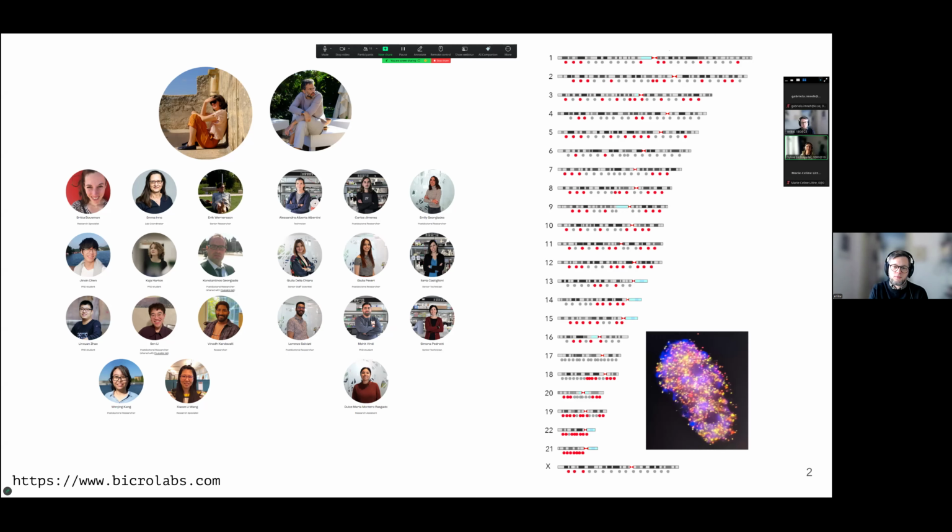We do a lot of things from FISH design to high-content screening, but one of our core techniques has always been wide field microscopy, and currently we use deconvolution for almost all pipelines. And as Sylvie said, we also have our own deconvolution software.